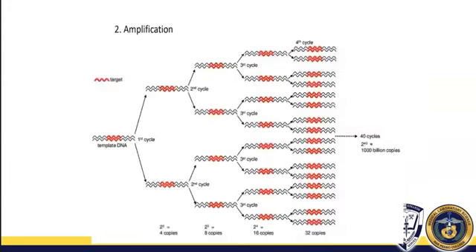Pag hybridization. And then of course, yung ating amplification, ito yung trabaho ng PCR talaga. It would amplify the genetic material of the target. So, di ba ganito lang kaliit yung target, hindi mo kailangan marami, konti lang. Pero i-amplify yan kasi we make use of templates, di ba? So, madodoble-doble yung number ng ating genetic material na ipaprocess. So, mas madaling hanapin.